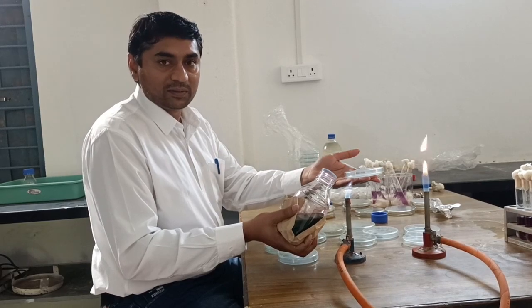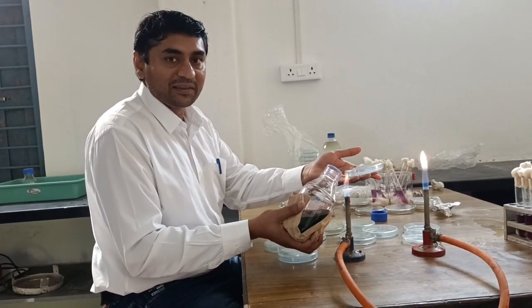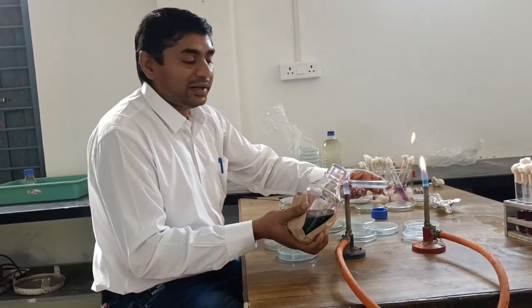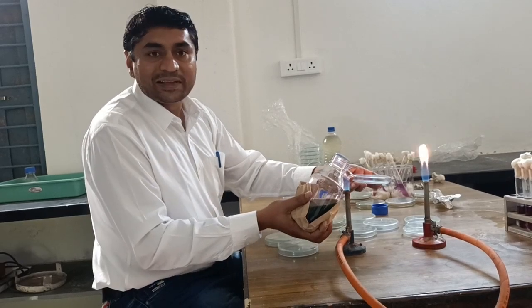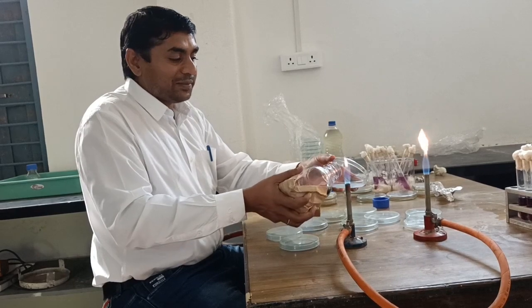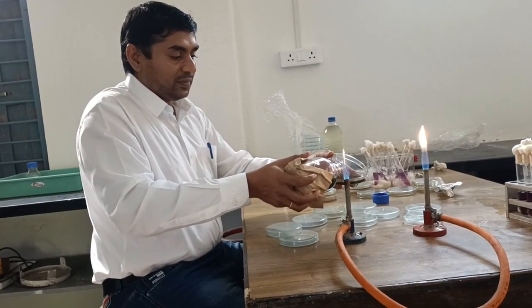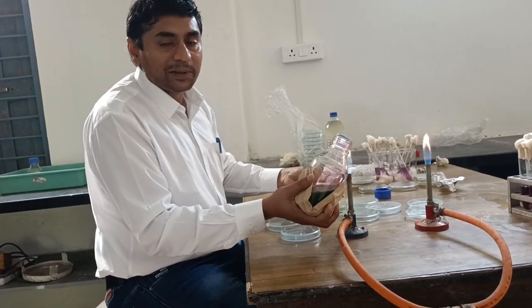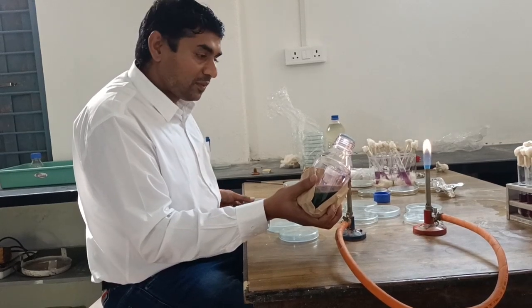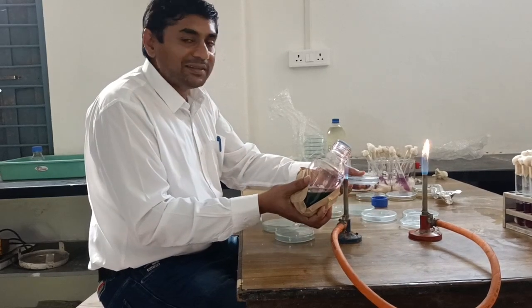Hold the petri plate in your left hand, then provide the base to the petri plate using three fingers. Use the index finger as a joint and thumb as an opener. Open your petri plate using your thumb, in front of flame only. The flame will prevent contamination and you should not remove the bottle away from the flame.